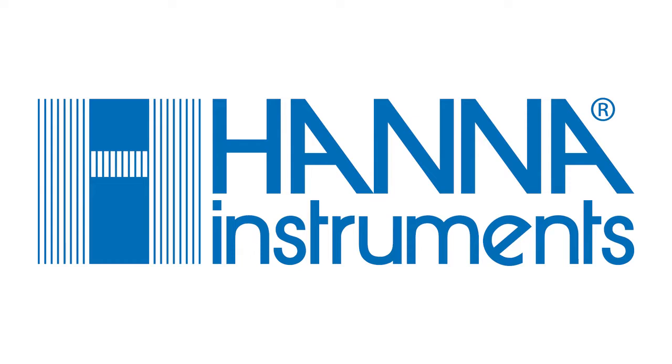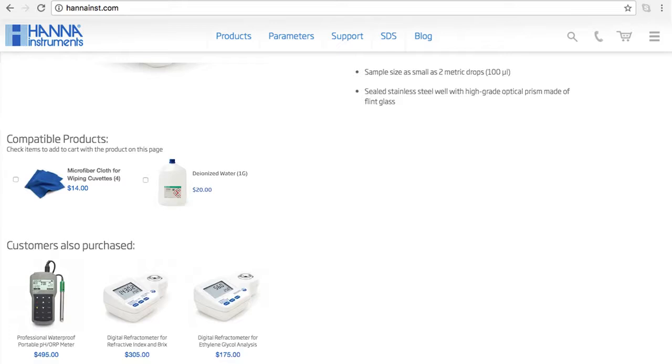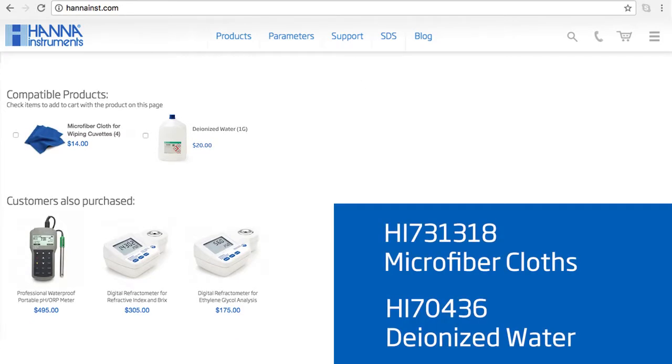HANA Instruments provides you with the necessary tools to succeed. Your meter includes one 9-volt battery and the instruction manual. I recommend you check out our compatible products on our website. For this meter, I recommend our HI731-318 microfiber cloths and HI70436 deionized water.